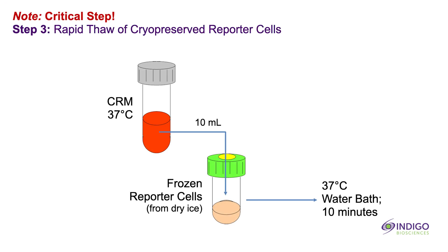Use the warm cell recovery medium to perform a rapid thaw of the frozen reporter cells. This is a critical step. First, retrieve the cell recovery medium from the water bath and sanitize the outside surface with an ethanol swab and put it into the biosafety hood. Next, transfer the tube of frozen reporter cells out of the dry ice and into a rack in the biosafety hood. Without delay, dispense the entire volume of warm cell recovery medium directly into the tube of frozen cells. Immediately transfer the tube into the 37 degrees Celsius water bath for a minimum of 10 minutes. This allows for complete thawing of the frozen cell pellet.